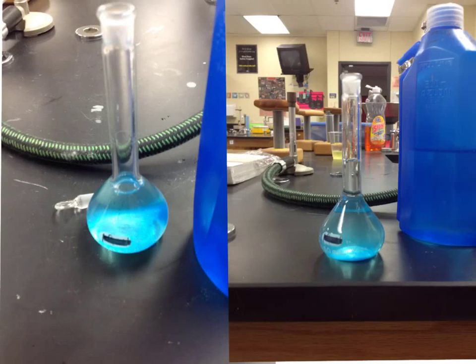When you get to the point here where the neck starts to narrow, you want to slow down adding the water because it's going to fill really fast after that point. You want it to hit the line exactly where the bottom of the meniscus hits the fill line on the flask. If you overshoot it, there's no way to take out the solution. So if you go over that fill line, you just have to start over. So it'll save you some time to just, once you get to this point here, fill it up really, really slowly a drop or two at a time until you hit that fill line.